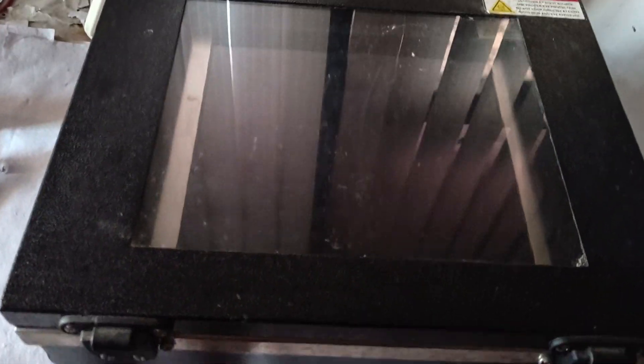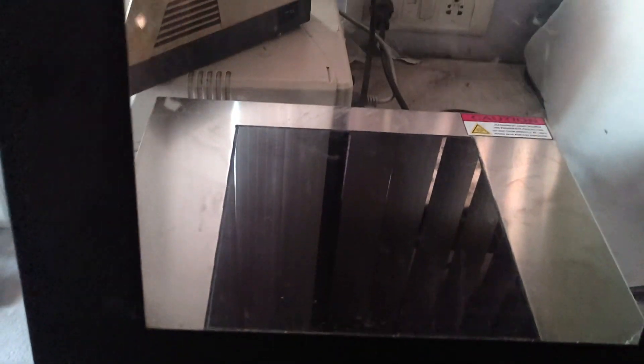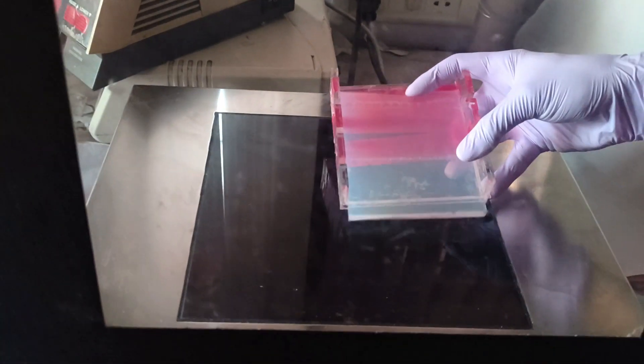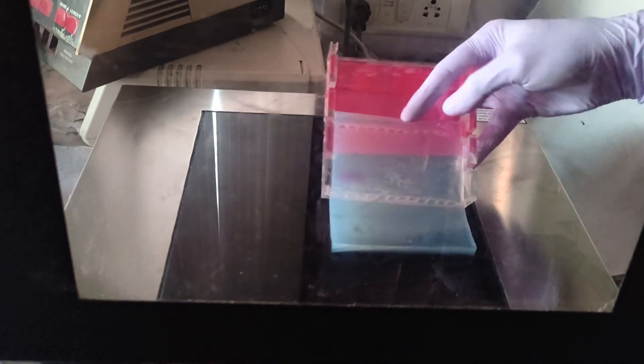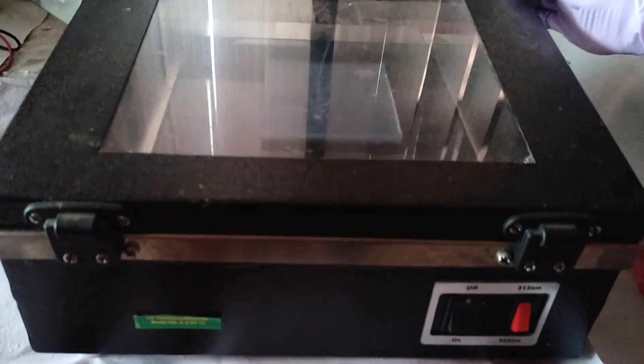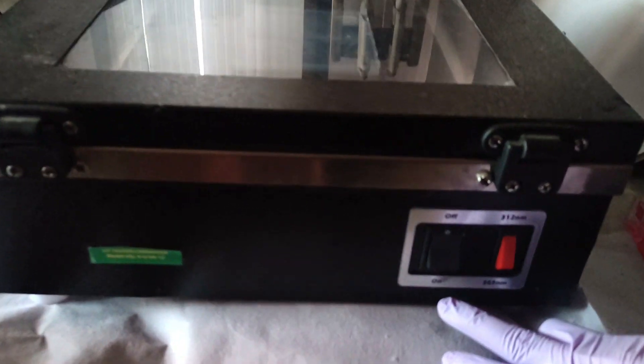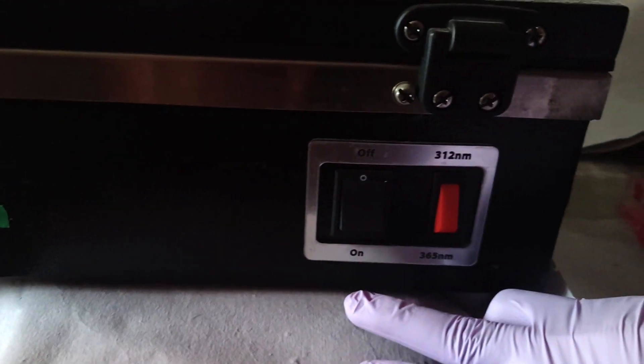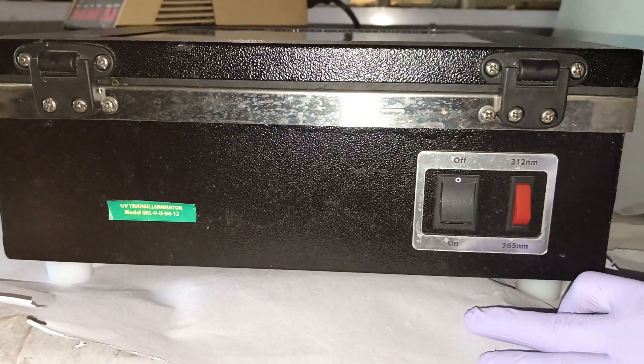Another way we can visualize the gel is by using a UV transilluminator. Switch off any external lights and place the gel on the UV transilluminator. It is very important to close the lid to avoid damage that may be caused by the harmful UV rays. Switch on the UV light.